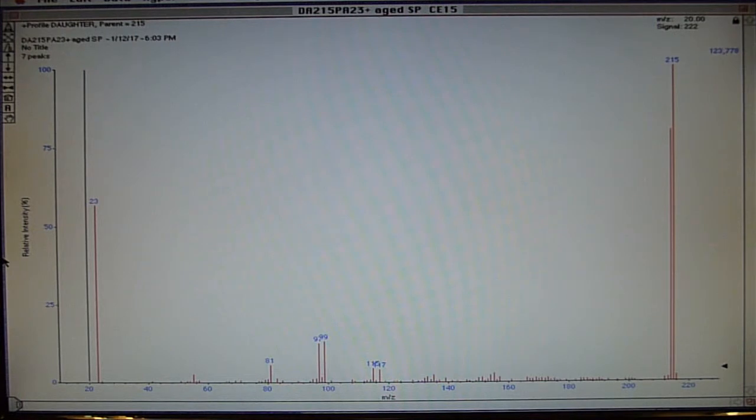Now one way of determining this is a sodium adduct is by doing a Q1 let in an ion and Q3 scans and then if you can scan down to 23 you've got a sodium adduct. Another way is to do a precursor ion scan and that's what this video is primarily about.